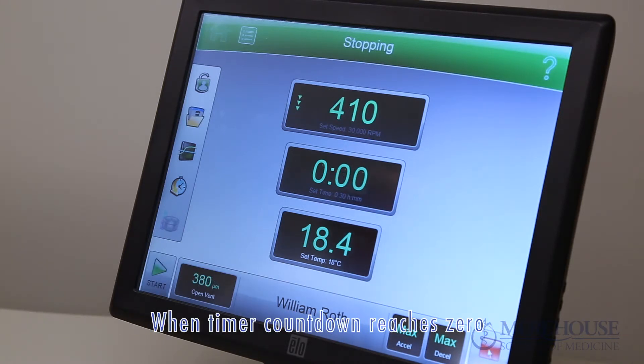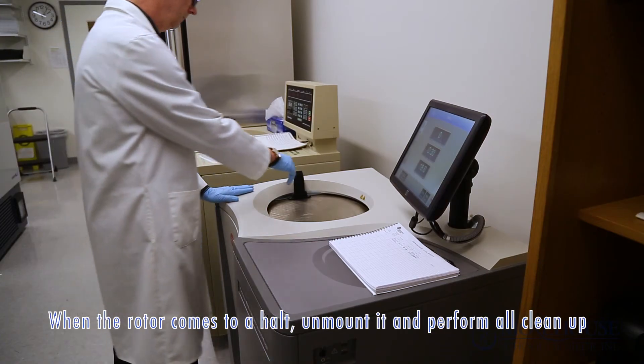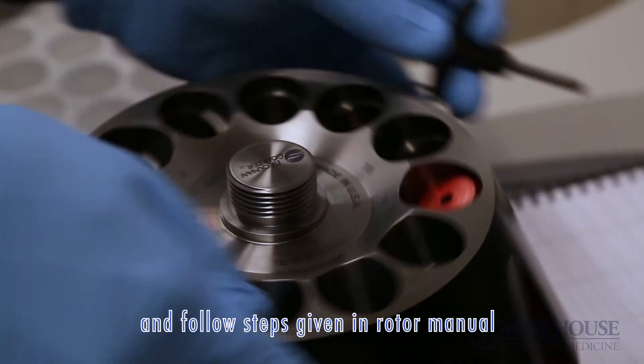When the timer countdown reaches zero, the instrument decelerates to the unloading speed and goes to the unloading phase. When the rotor comes to a halt, unmount it and perform all the cleanup and follow steps given in the rotor manual.